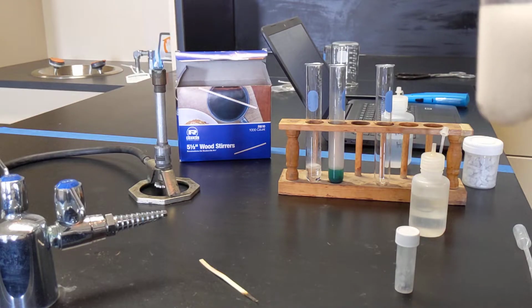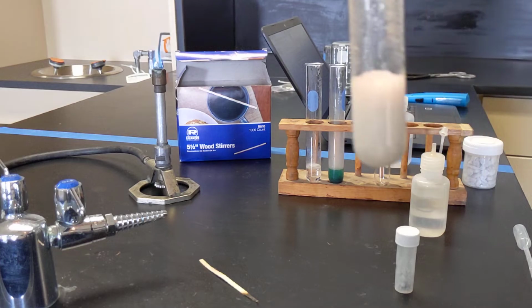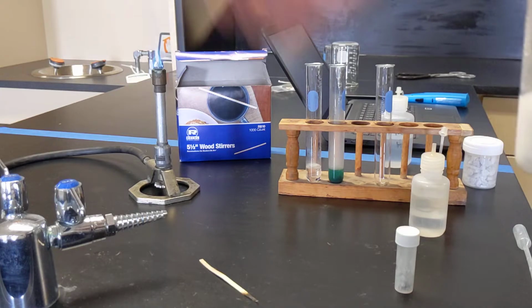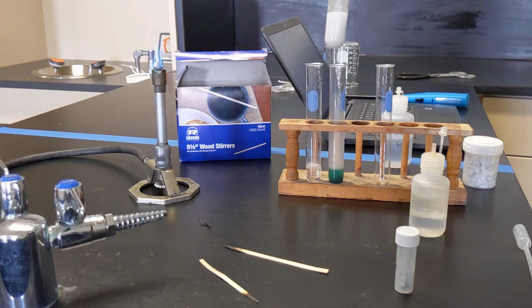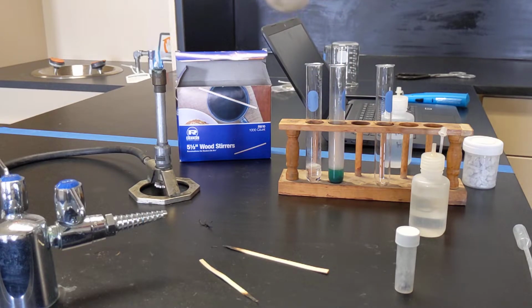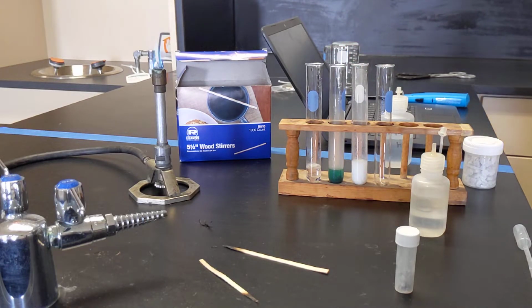I'm going to let this gas build up for a minute. I'm going to throw this in there. We'll see what happens. Ooh, that went out immediately. So it should tell you which gas it is if it went out immediately. Remember, hydrogen explodes. Oxygen makes reactions happen faster, specifically combustion reactions. And then carbon dioxide would put a combustion reaction out. Basically snuff it out.